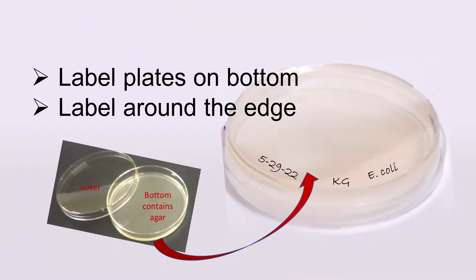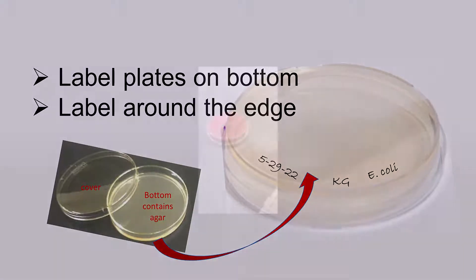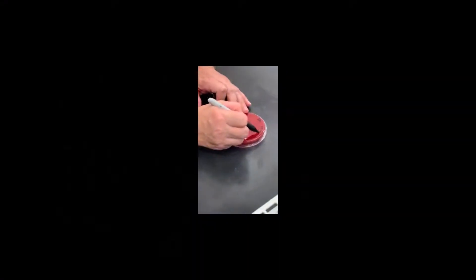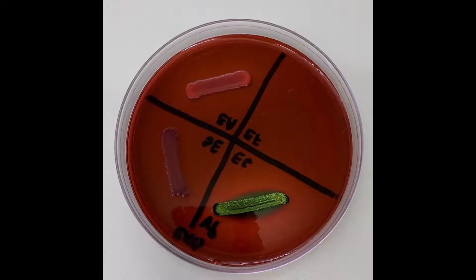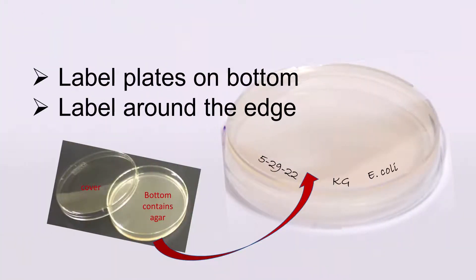Proper handling of plates includes things like labeling plates on the bottom. It's standard practice to include your initials, the date, and the initials of the microbe on the plate. Sometimes your instructor will specify other information too, perhaps your section number, the type of media, or where the sample is from. The reason we label on the bottom is because when more than one microbe is cultured on the plate at the same time, covers can get turned during incubation and that would lead to confusion. We always label around the outside edge so you have a clear view of your results without the ink obstructing your view.